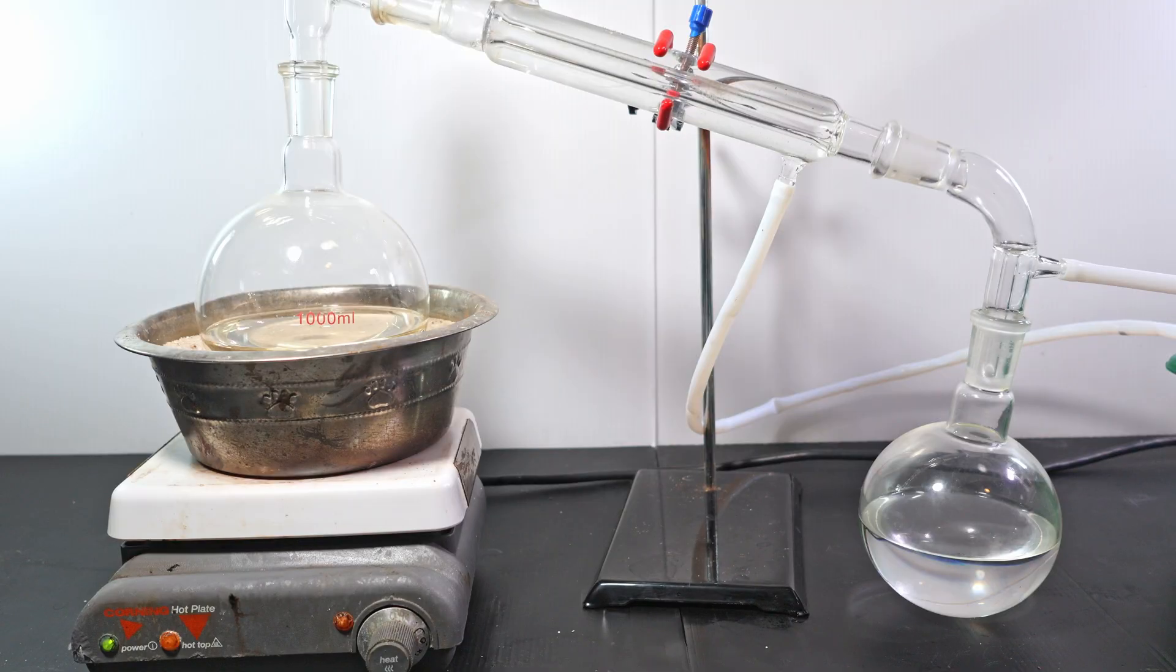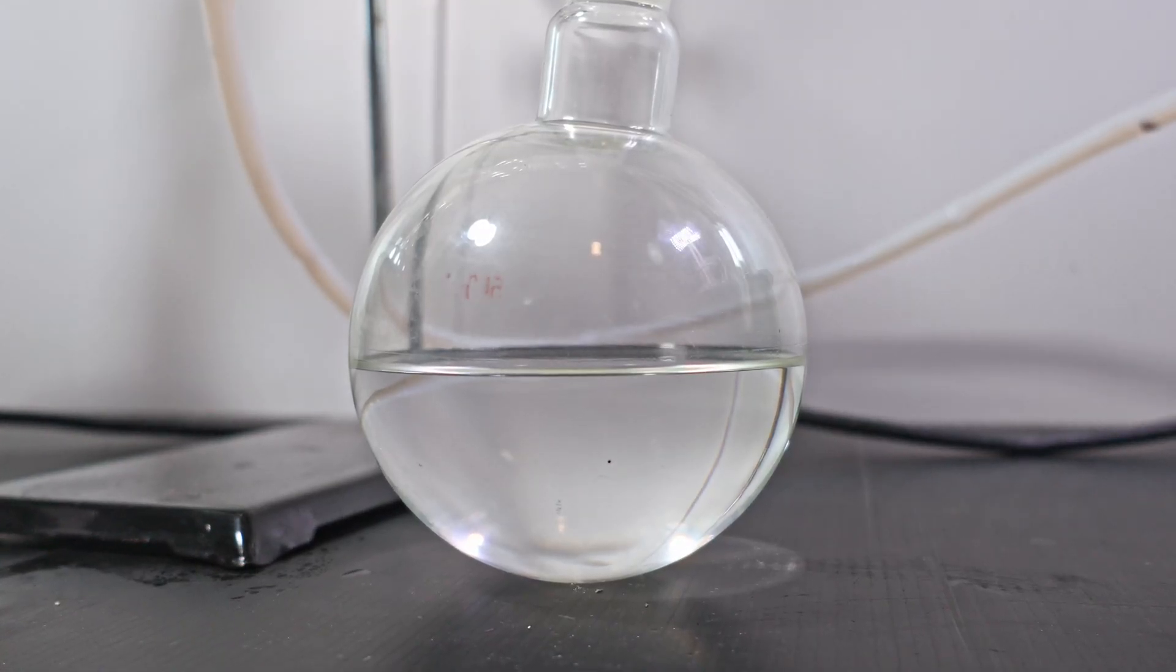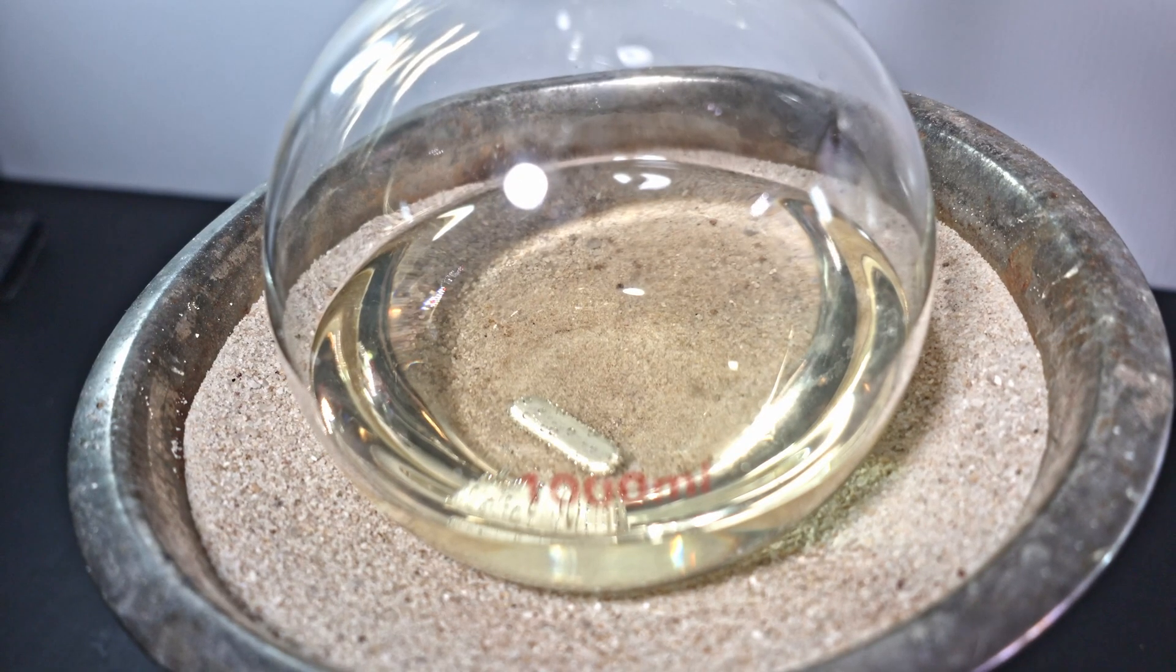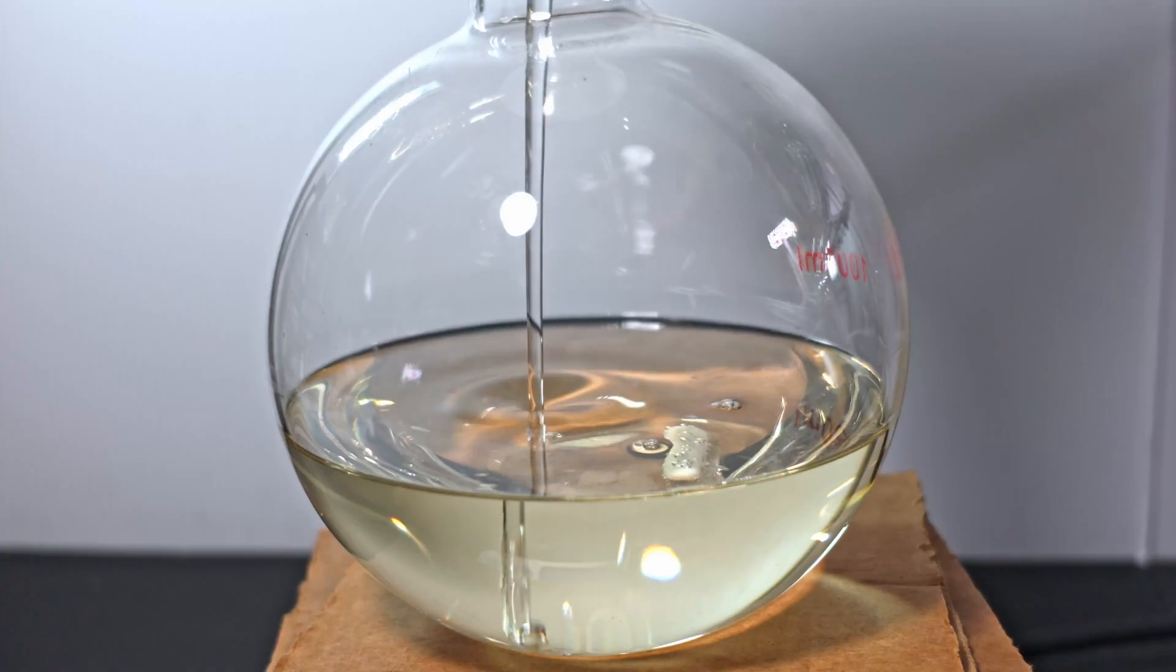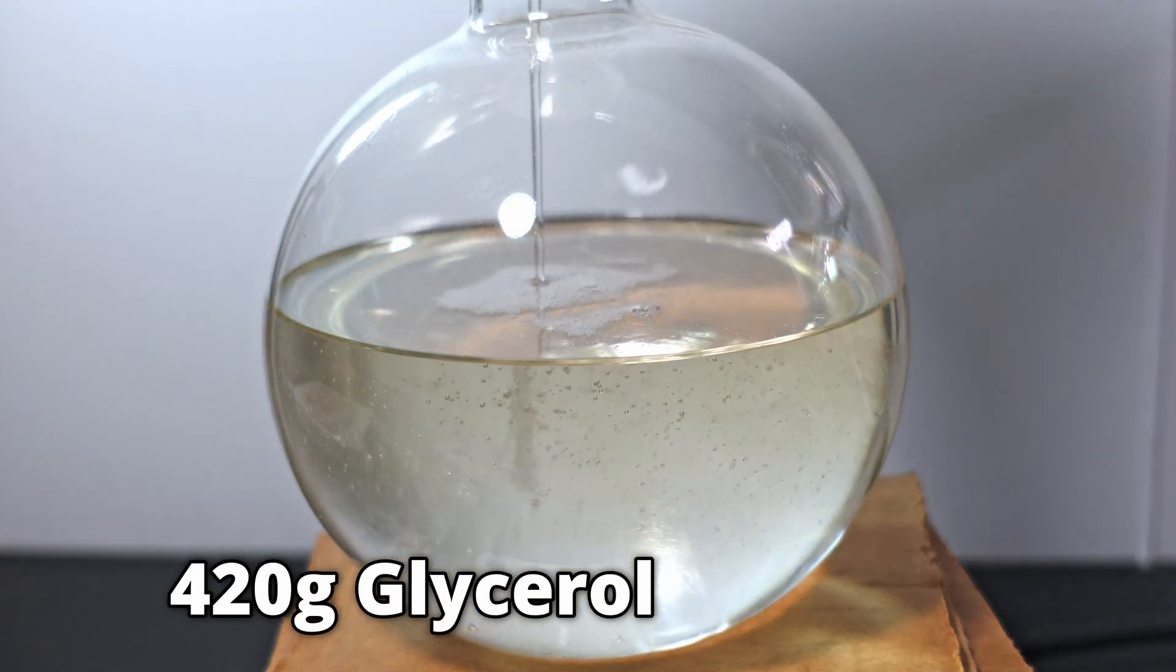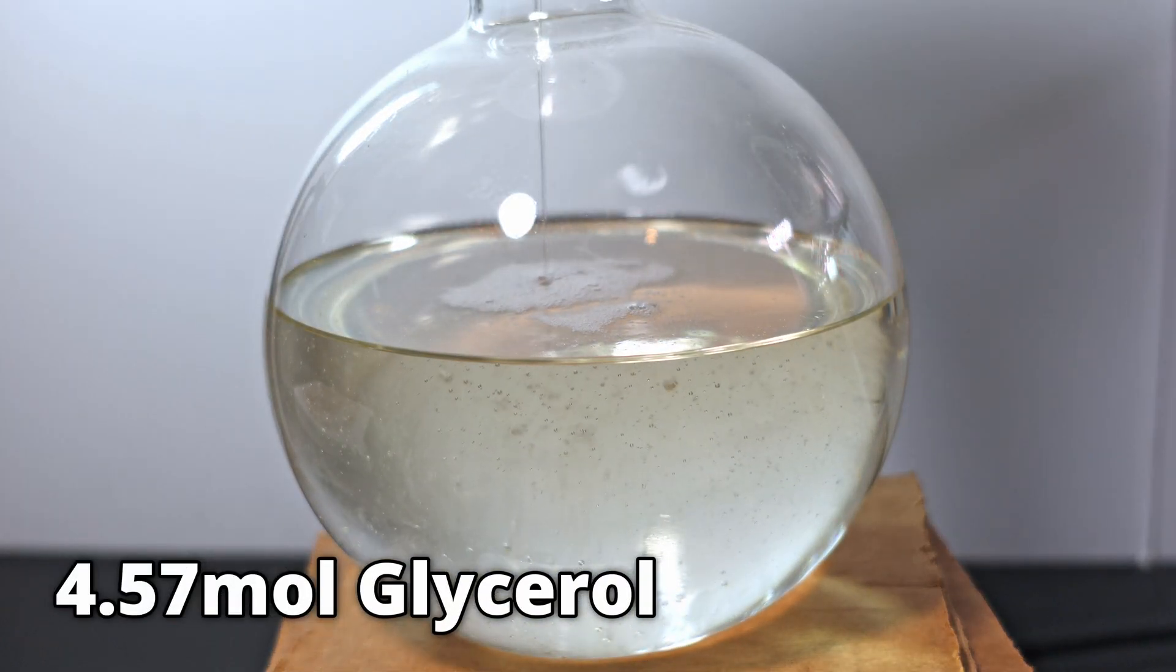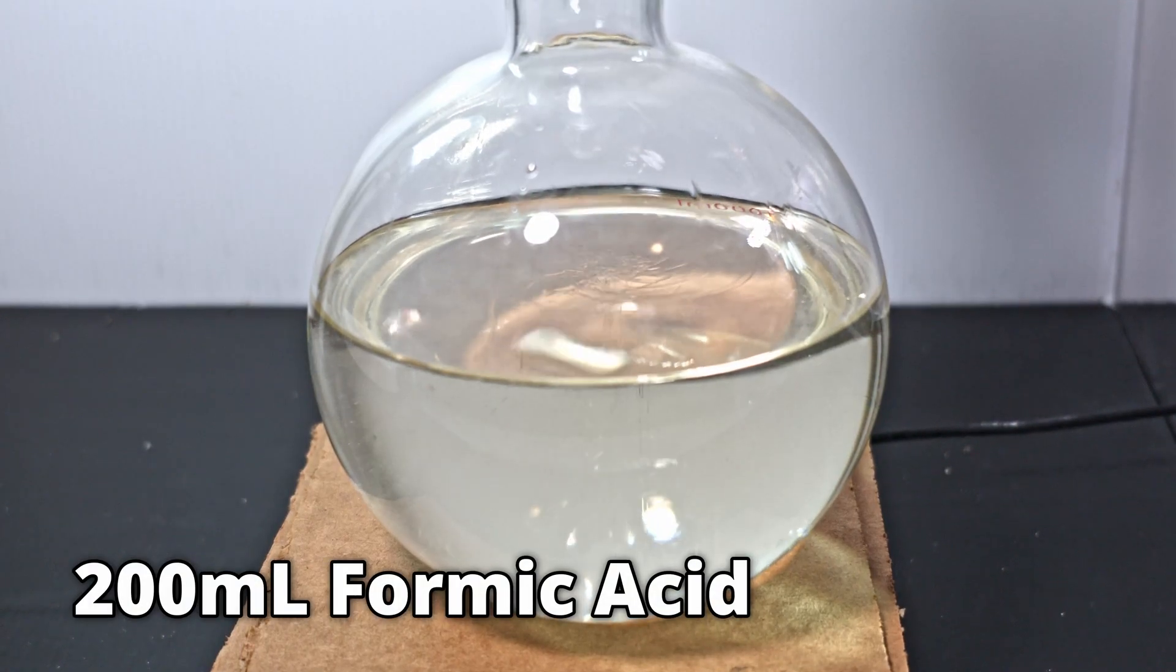After a few hours, I shut it off when no more comes over. I have a pretty good yield so far of crude allyl alcohol. My glycerol has just a little discoloration, but it's still more than good enough for a second run. I add in 420 grams of warm glycerol. This is approximately 4.57 moles of glycerol. I add in another 200 milliliters of formic acid slowly.